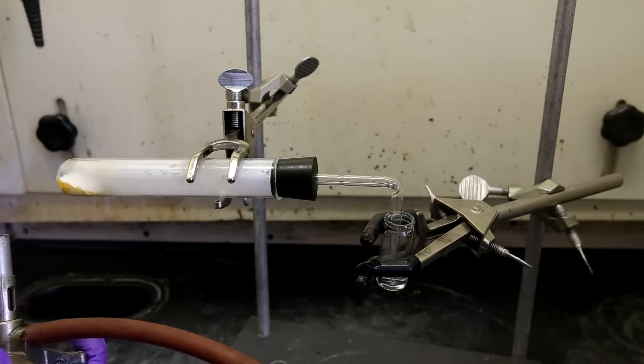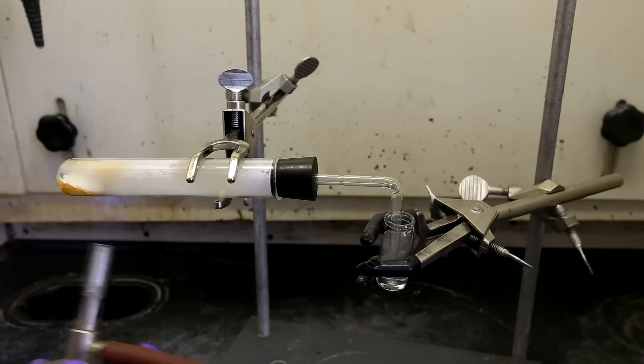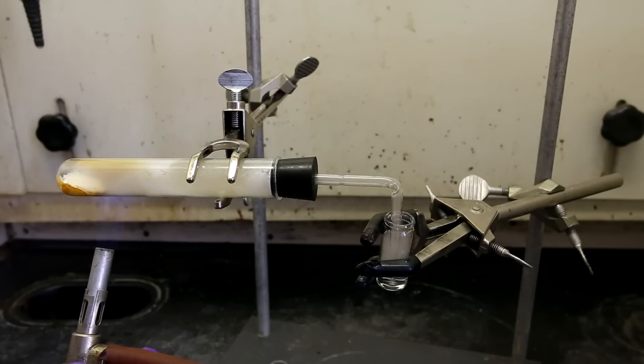However, since cadaverine boils at 179 degrees Celsius, a lot of it is going to be vaporized. The cadaverine in its vapor form will lead out of the tube and then bubble through the water and be trapped.